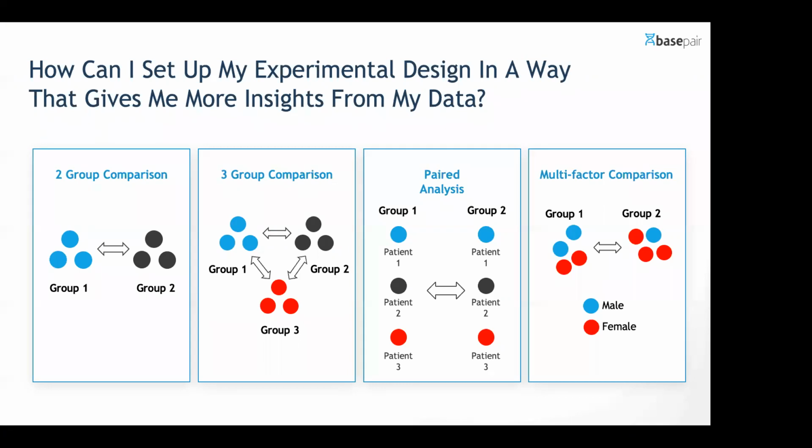That is, if you have 2 different groups, say you have a group of patients and you took samples from them at time 0, and then you gave them a treatment or something, and at a later time point, you sampled the same patients. So when you're comparing this baseline and this treated group, you should take into account the fact that you're sampling the same patients twice.